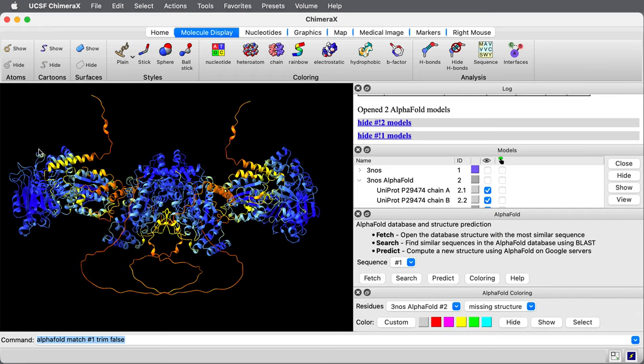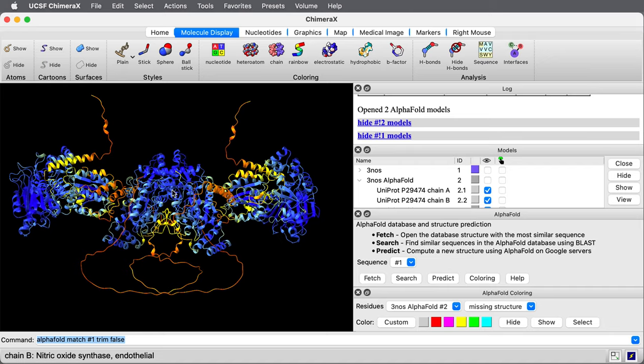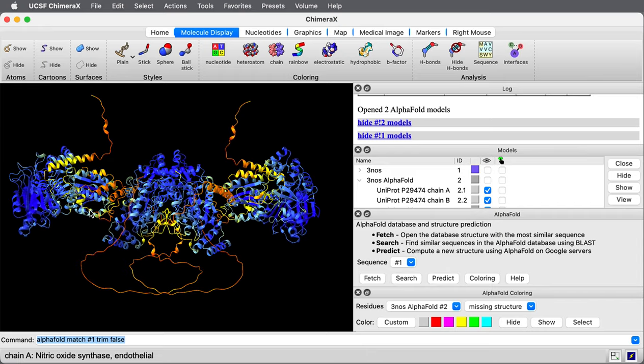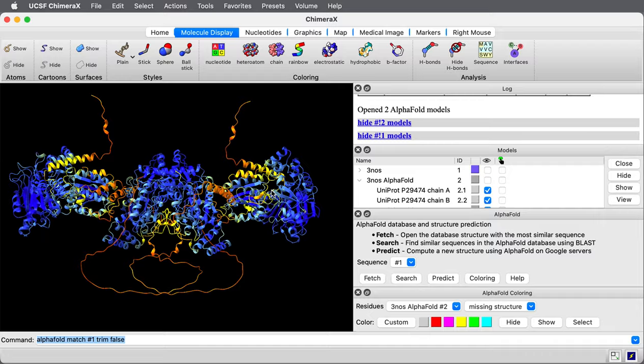You see some big domains on the side here that weren't part of the experimental structure. If we look at uniprodit, this gene, it shows what parts of the gene have experimental structures. Only this central part has experimental structures available. So these domains on the side, the alpha fold prediction is a good way to look at the possible structure of those domains when experimental structures are lacking. There are probably also homology models from other species available for these domains on the sides.